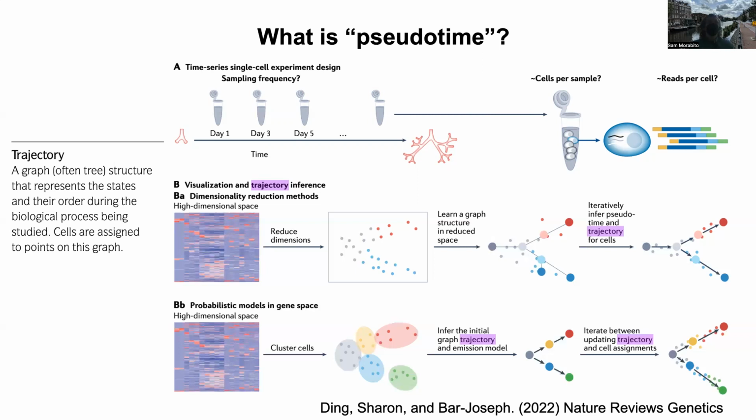So literally just figuring out what mutations they have and how similar the mutation profiles are to the ones before, and you can infer a trajectory of mutation burden or accumulation over time, which is crazy to me. But yeah, I don't know. I'm sure you could do it in cancer, but with cancer, you always have to be aware of the fact that the DNA is also changing. It's not just the RNA.